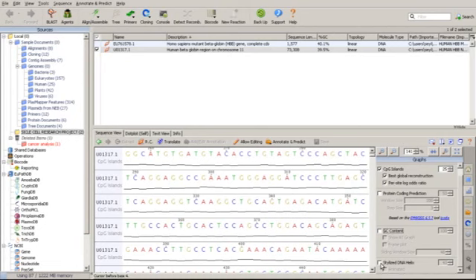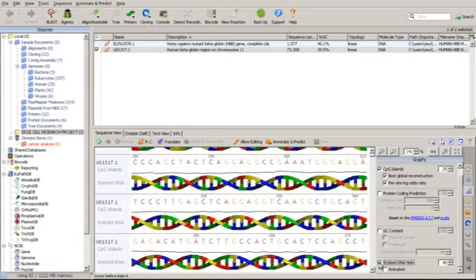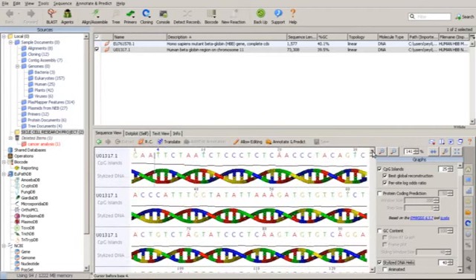So just click it and then you find something like this. How wonderful. Go back to the first place. This is 1, 4. This is where the sequence actually begins. As you can see, this is actually a DNA helix, a double-stranded DNA structure.